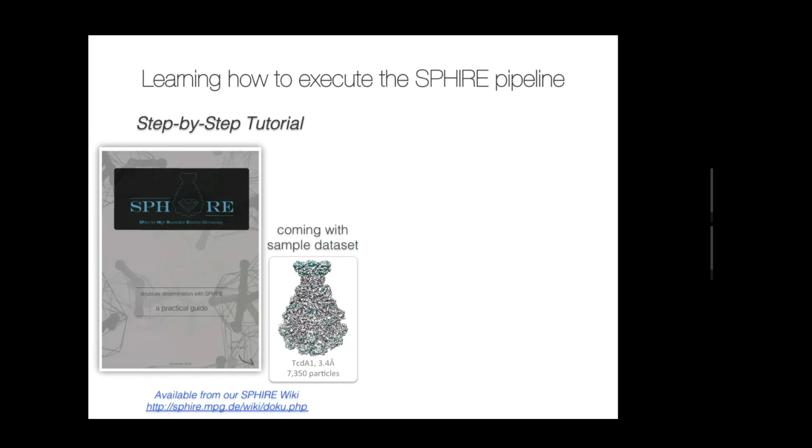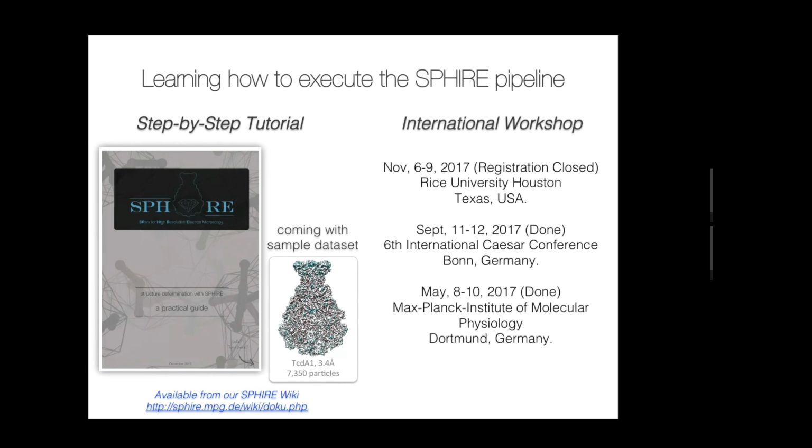Today, I presented only the overview of the Sphire user-friendly pipeline and its easy-to-use GUI application. If my presentation made you interested in Sphire and you want to learn how to execute the Sphire pipeline in detail, please try out the step-by-step Sphire tutorial with the sample dataset. We are also organizing the International Sphire workshop periodically.